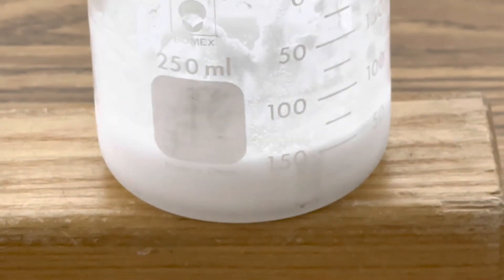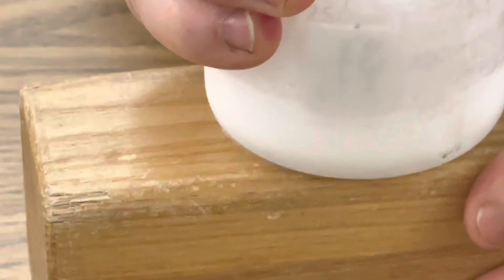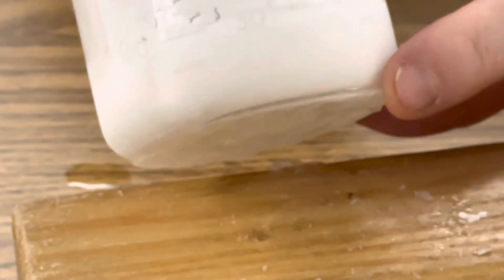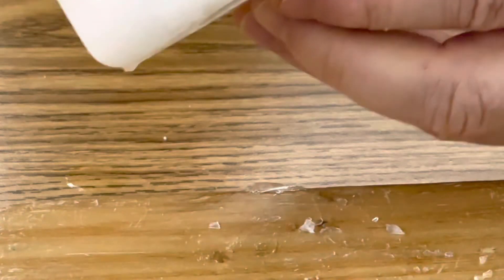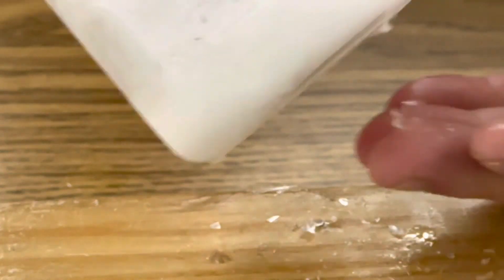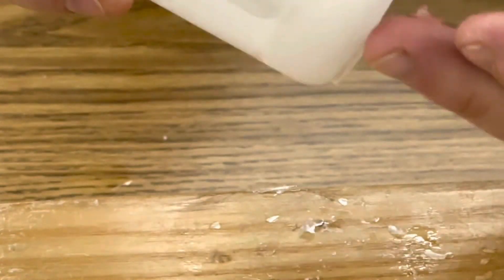Let's see if we can twist off the beaker and actually see some ice underneath there. It's really on there tight. I can shake it — it does not want to come off. There we go. You can actually see some chunks of ice right there on the block of wood. You can see ice. Look at my fingertips — it was really frozen to the block of wood. That is incredible.